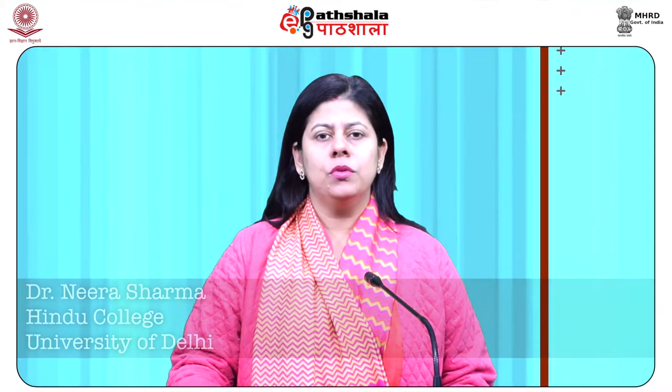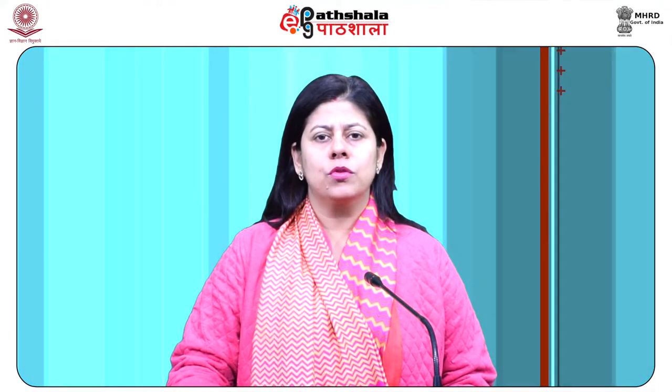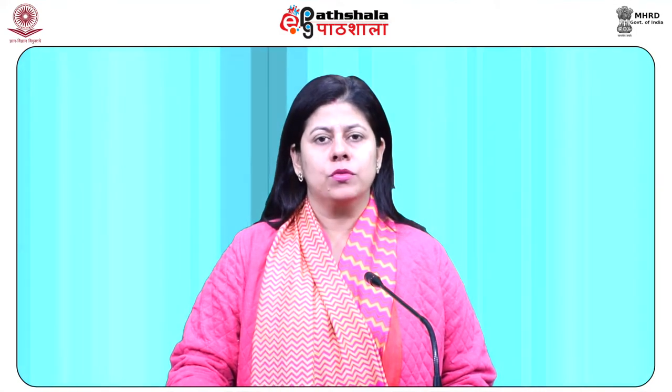After studying this module, you shall be able to know about the significance of simple microscopy, the basic principles and methodology of microscopy, the types and application of microscopy.